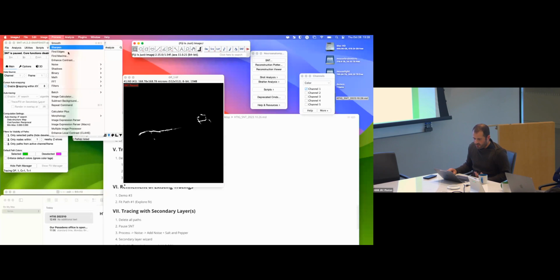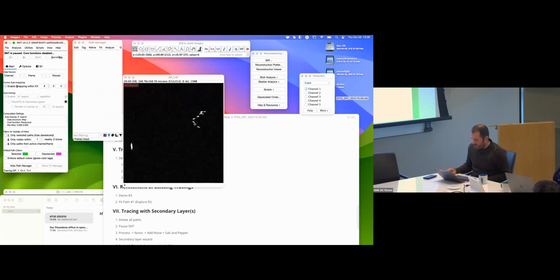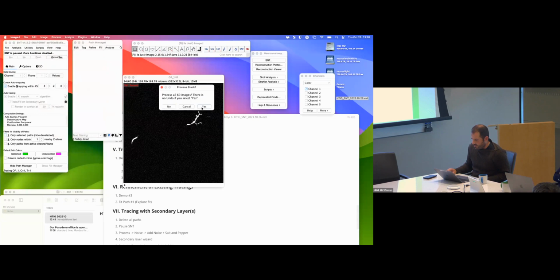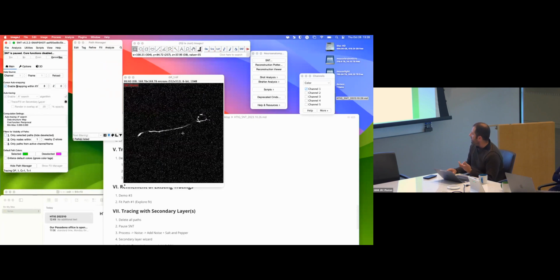So I'm going to degrade this image a bit. So I'm going just to introduce some noise. That's just not enough. I'm going to make more noise even just to make the point. I don't know, I guess some salt and pepper would work. Okay, so now you have an image that is degraded. Okay, so the image now is dirty, and the signal to noise ratio is worse.